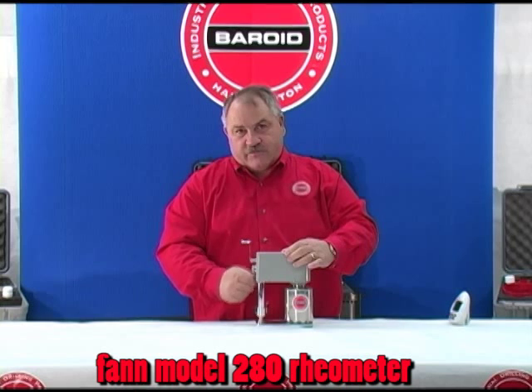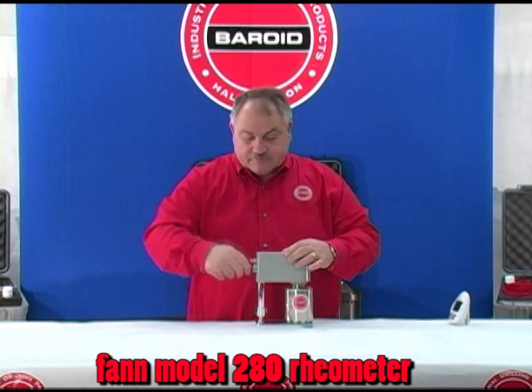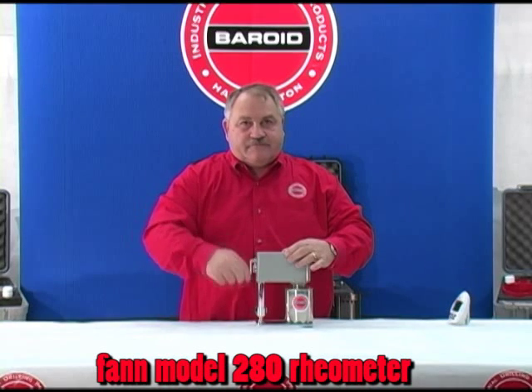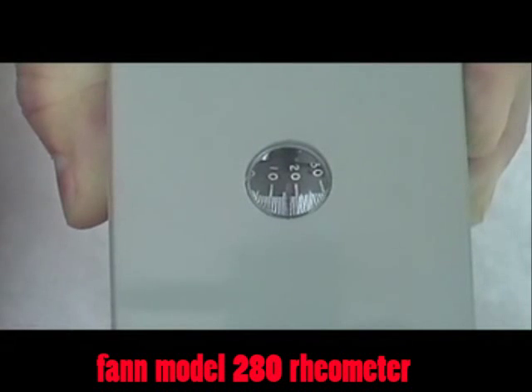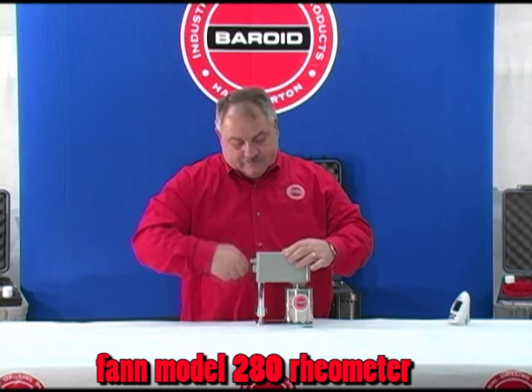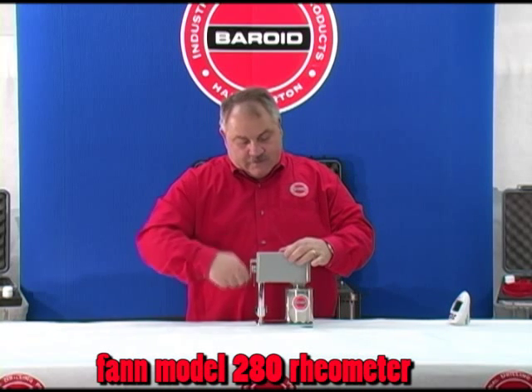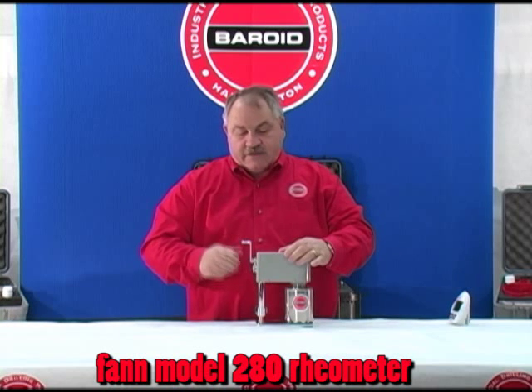We move the selector to 300 rpm and rotate the crank — the slip clutch allows 300 rpm. We go back to stirring speed for a minute and stir it up, then come back to 300.